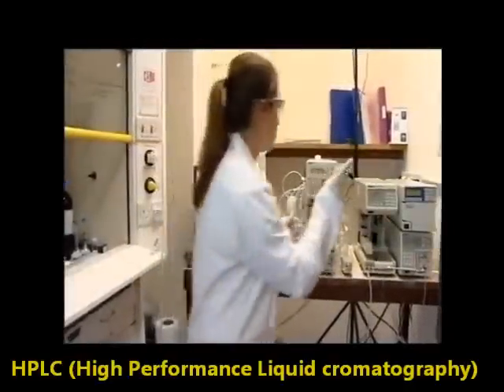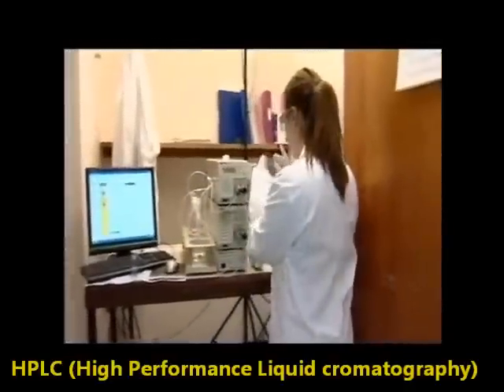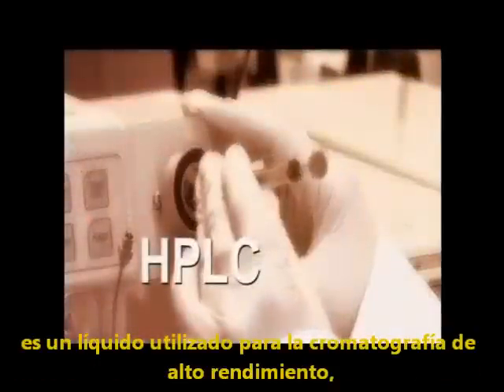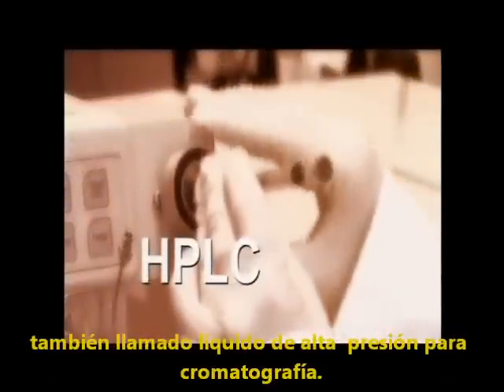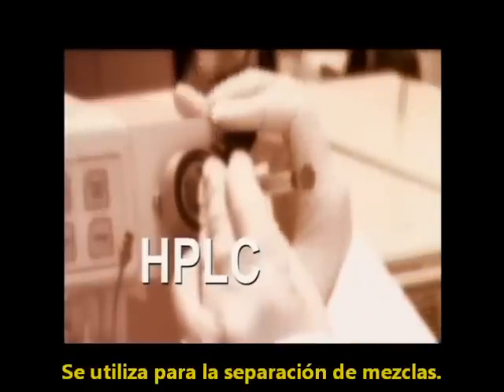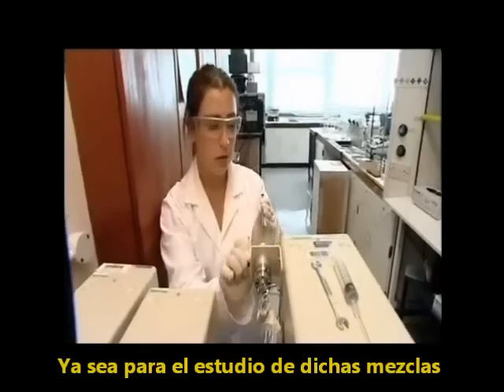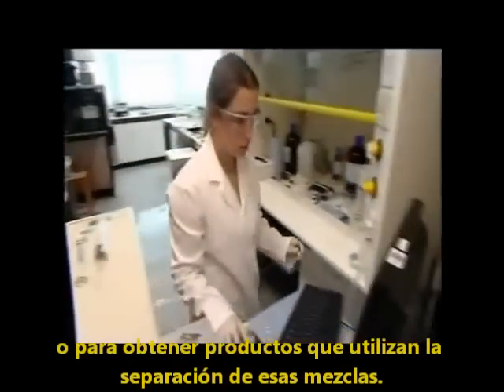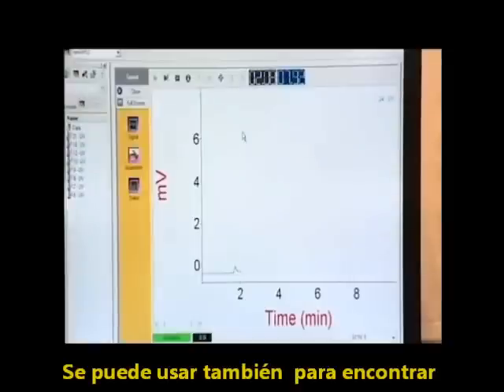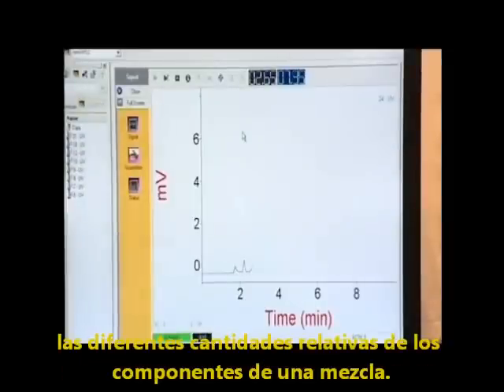HPLC stands for high-performance liquid chromatography, but could equally well stand for high-pressure liquid chromatography. It is used for separating mixtures, either to analyze the mixture or to separate a required product from others in a reaction mixture. It can also be used to find the relative amounts of different components in a mixture.